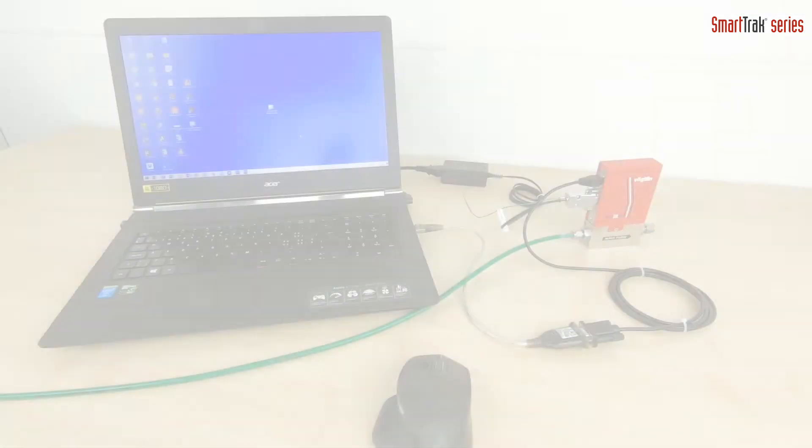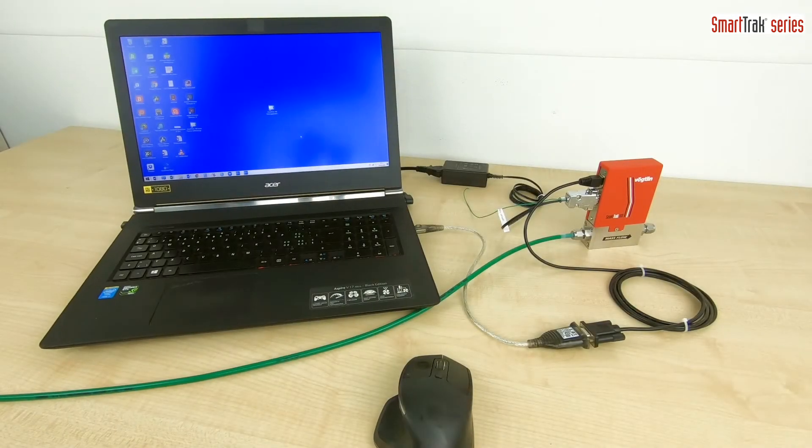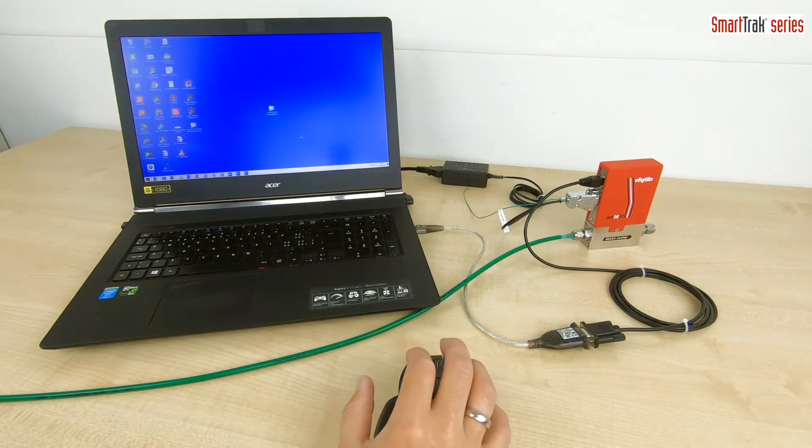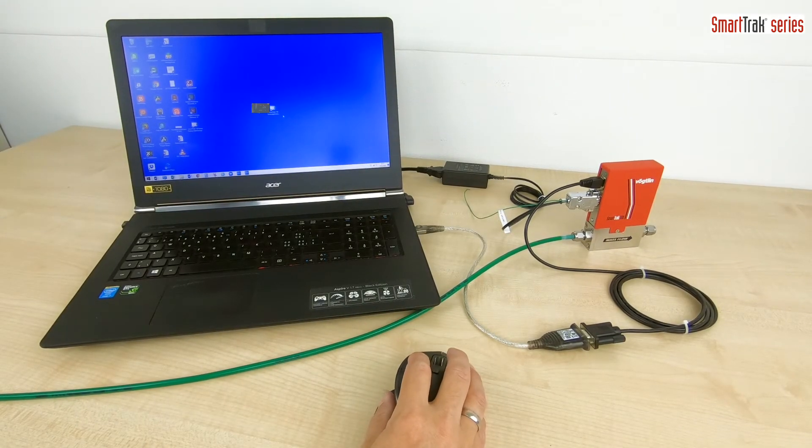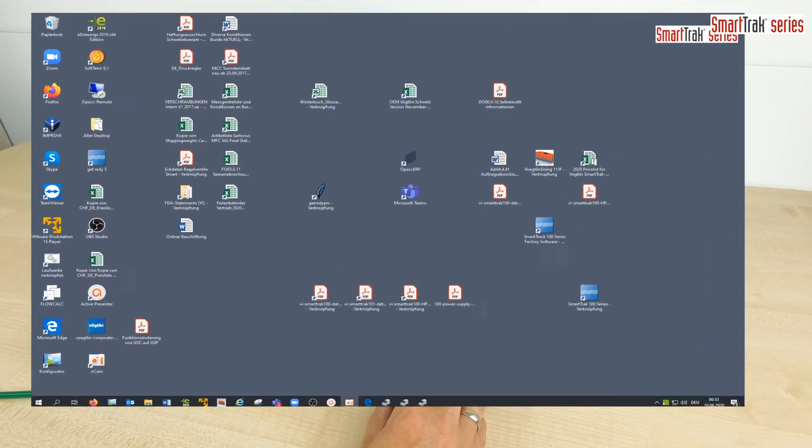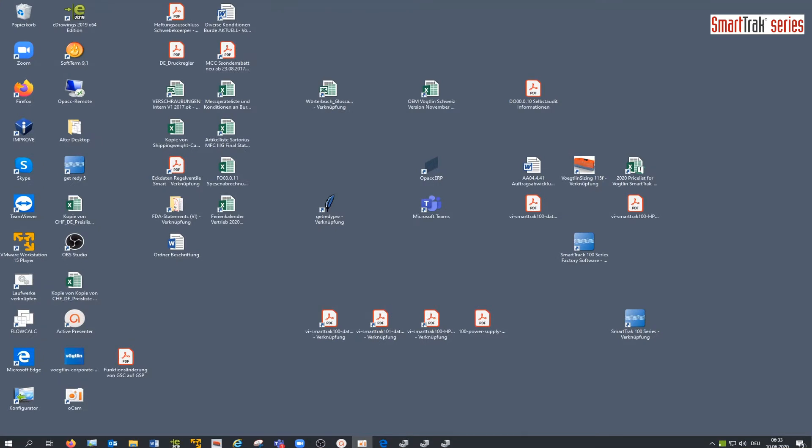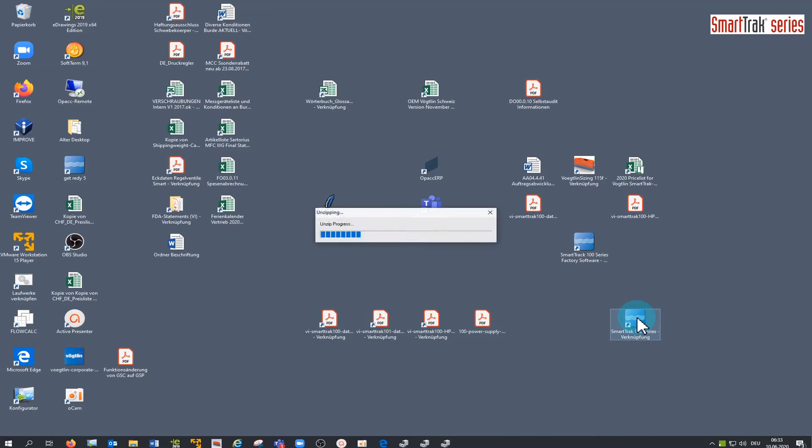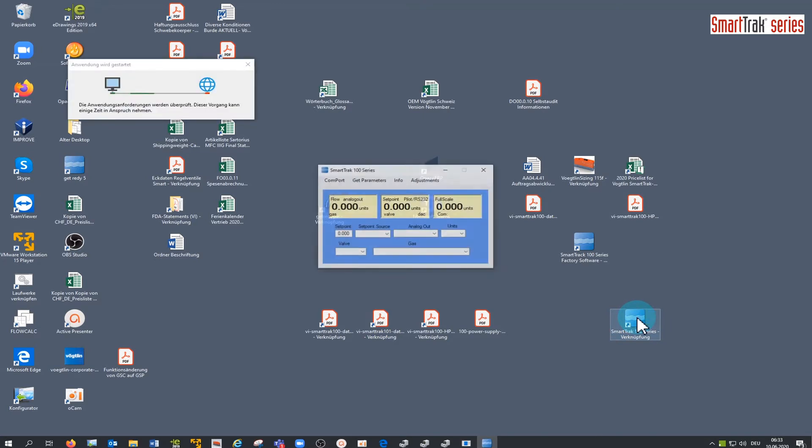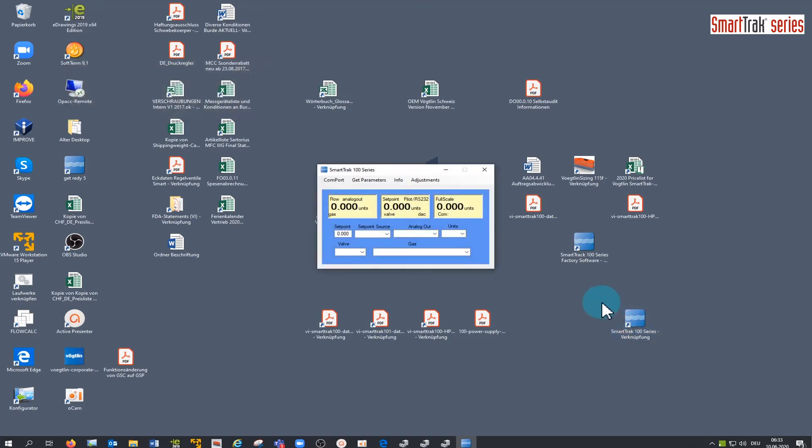This is the hardware and now we connect the device to the software. On this laptop, the software has been pre-installed. Click on the icon of the SmartTrak 100 series software to open the application. Click now on COM port to choose the right COM port.